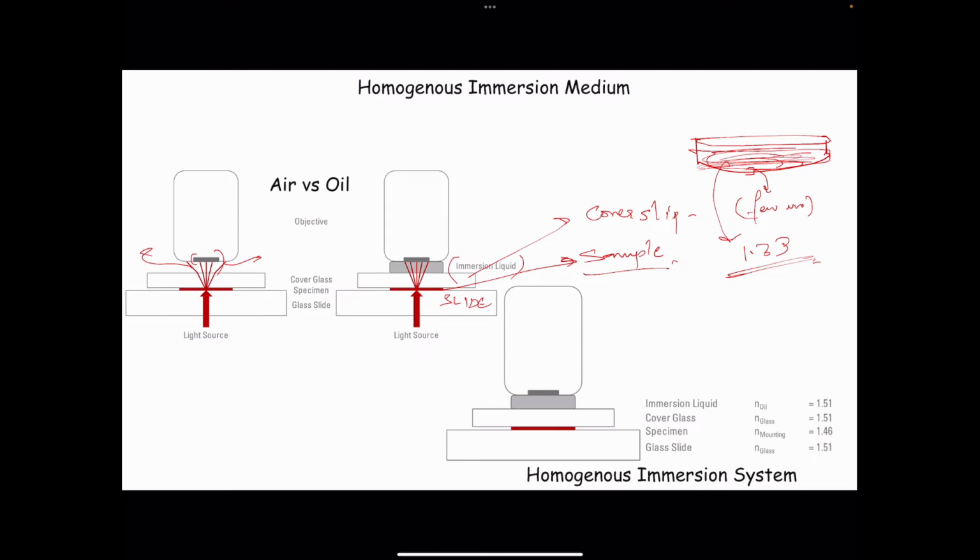If you are working with fixed samples, let's say if you want to fix the cell, there are different methods by which you can fix the cell and study the fixed cell or dead cells, or basically the preserved cell as we call it. You can do methanol fixation, you can do formaldehyde fixation. One is a cross-linking based method and the other is a precipitation based method. Now, all of these methods differ from each other fundamentally.